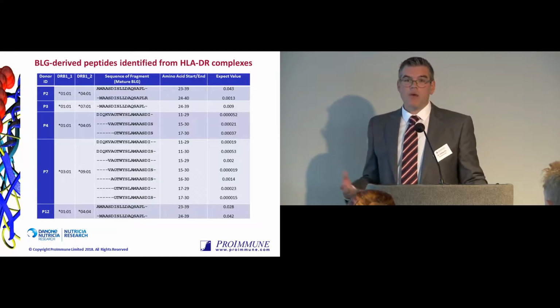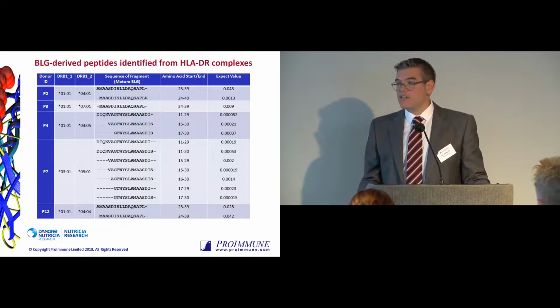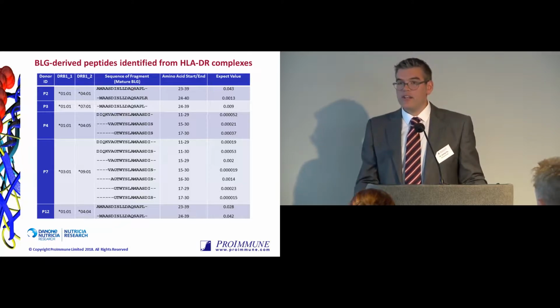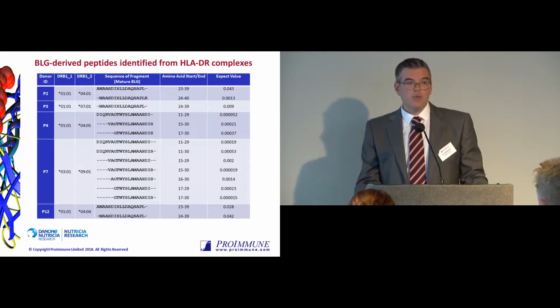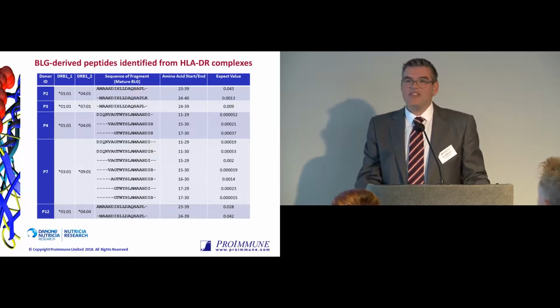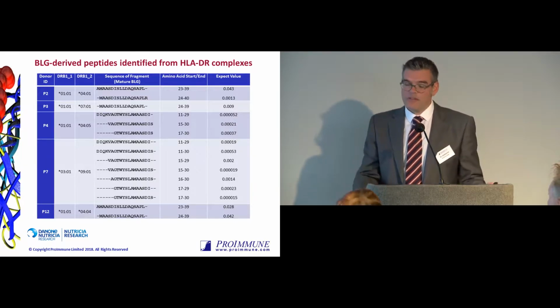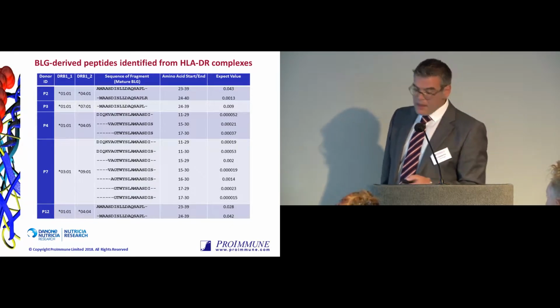And the great thing about this as well is that we can actually look at post-translational modifications to a certain degree, such as phosphorylation, oxidation. A whole range of different PTMs can be looked at in this assay as well. So if you know that and you want to specifically look for those mods in advance, then we can also help you out. The exception, and again one of the common questions, is glycosylation, and that is a massive challenge because of the complexity of sugar chains and the different options that are available. That's not something that can really be looked at in a simple way through this particular assay.